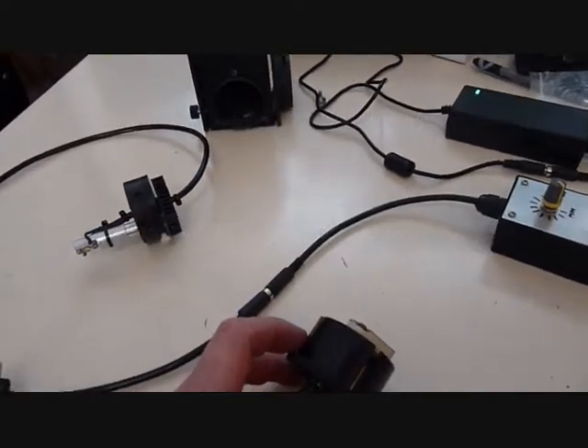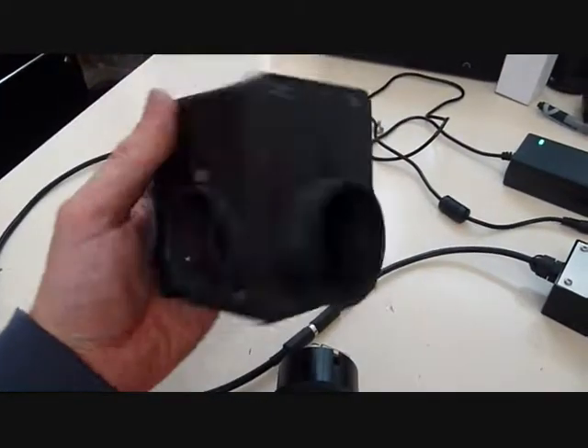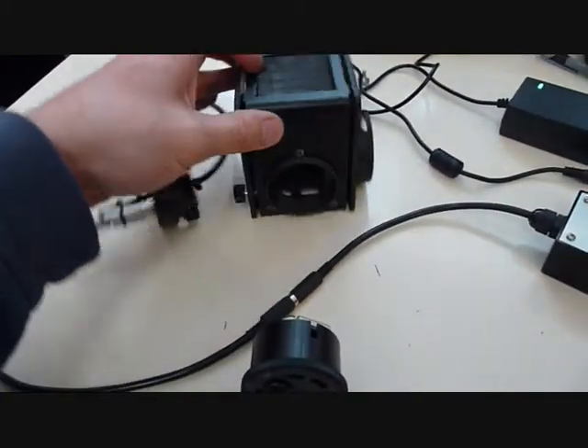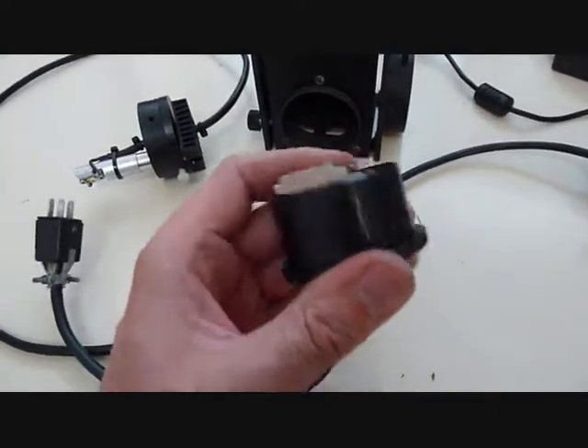Just showing you the LED upgrade for a Nikon TMS microscope. This is the light box. It usually has a halogen bulb in it. It slides in from the side on this holder here. You can see the socket for the bulb there.